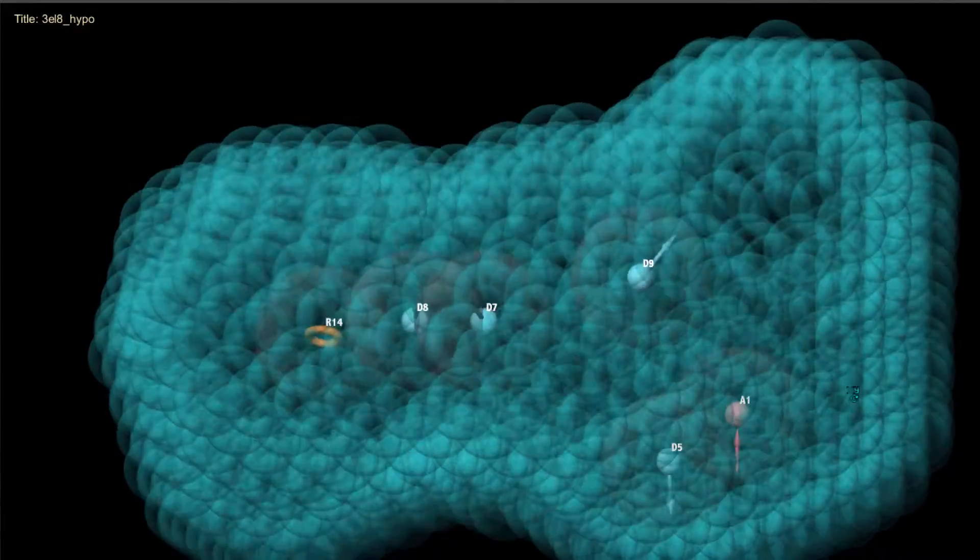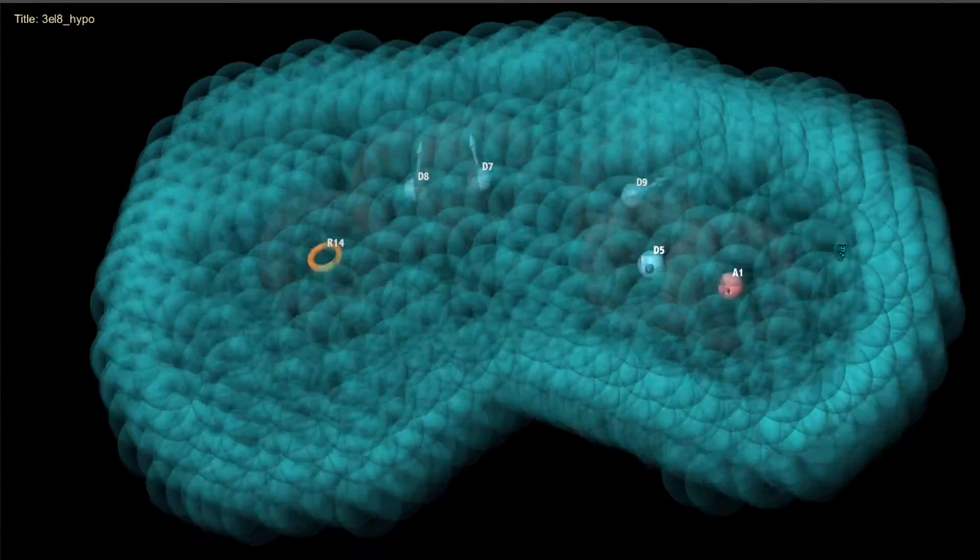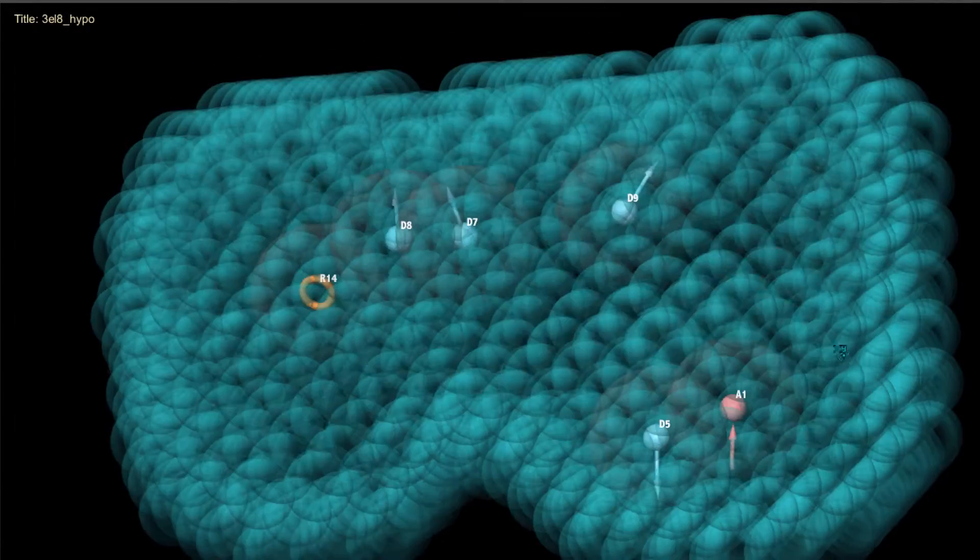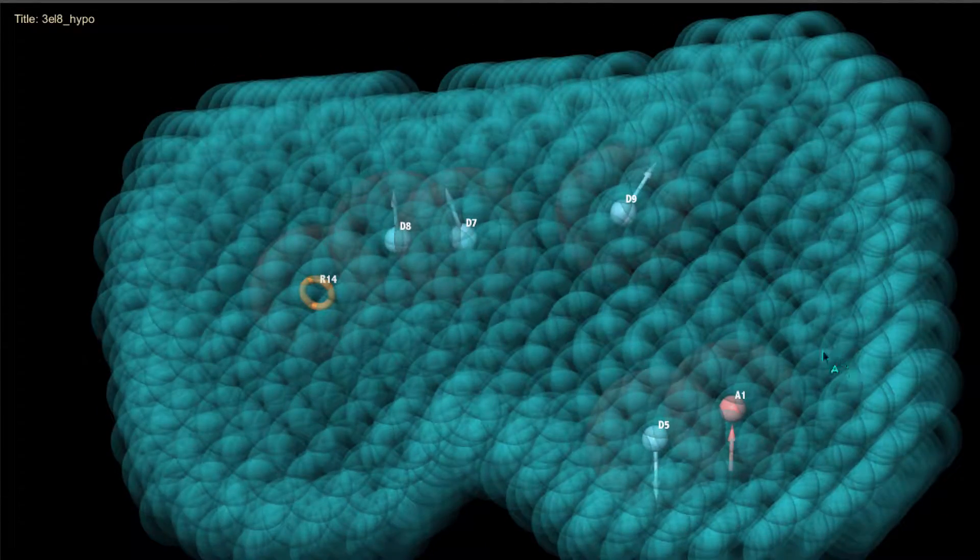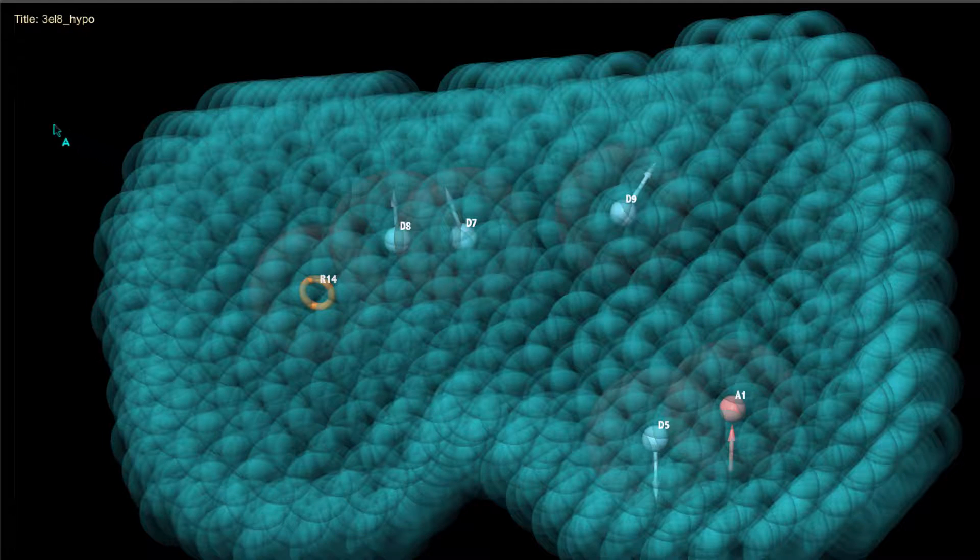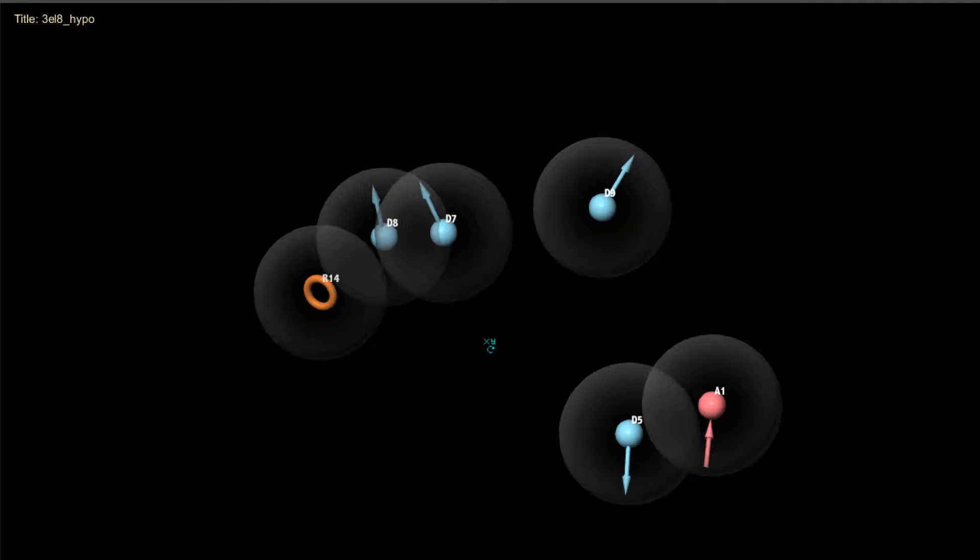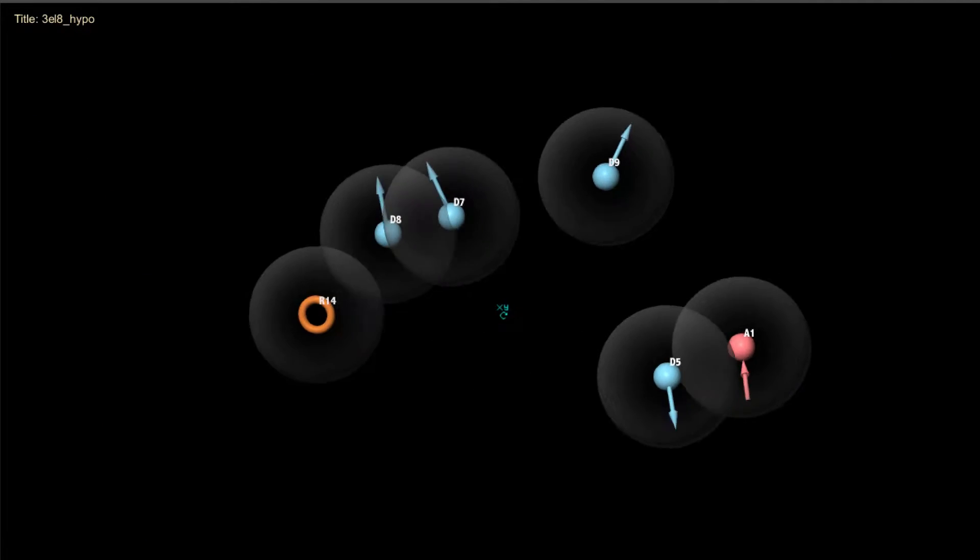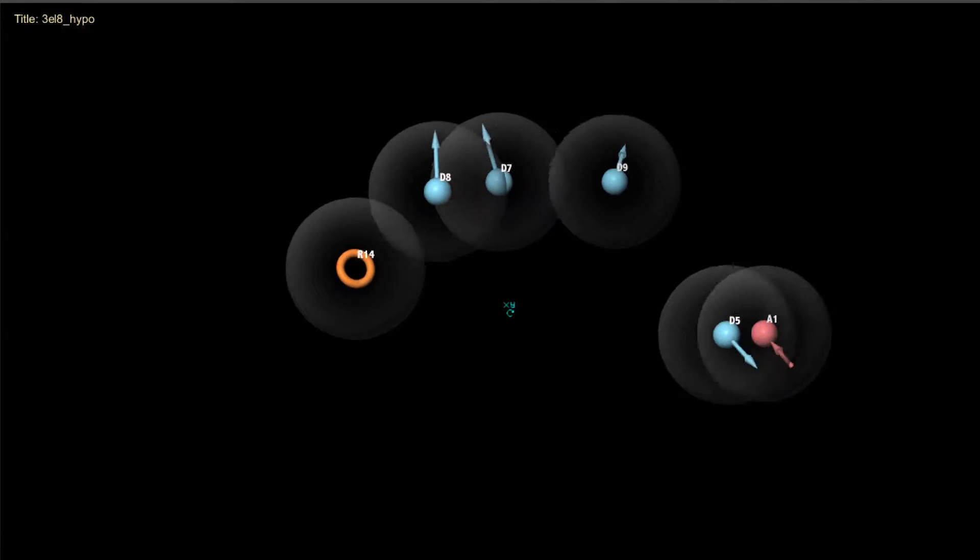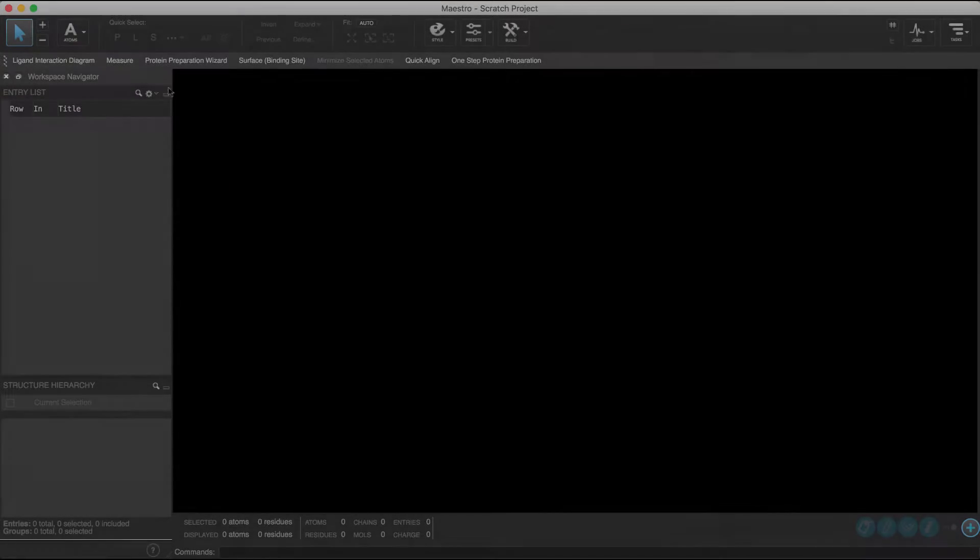In this video exercise, we'll demonstrate how to use Phase to create a pharmacophore hypothesis from a single 3D ligand in the workspace. We'll use the example in the Phase tutorial. So let's begin.